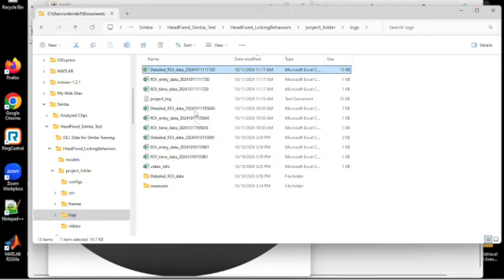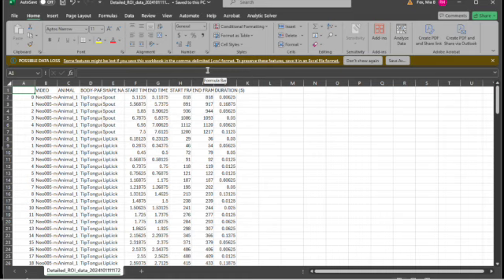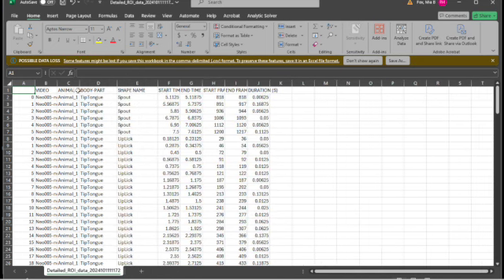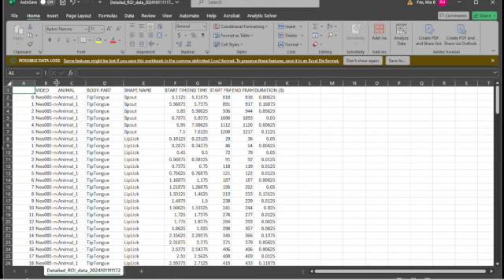So you can see I've created this multiple times. It will create a new one each time you do it, within reason, if it's a few minutes apart. So I can open this up, and this will show me the start and end frames that the tip tongue entered those regions of interest. It will do it for every ROI region, so I don't ever expect my tip tongue to be entering my whisker areas, but it will be looking for that.